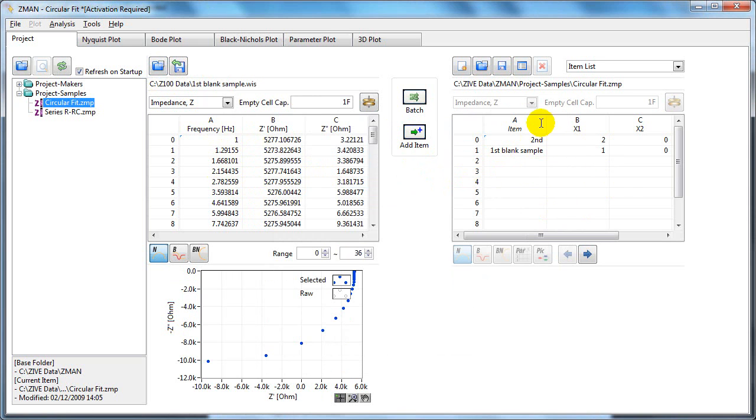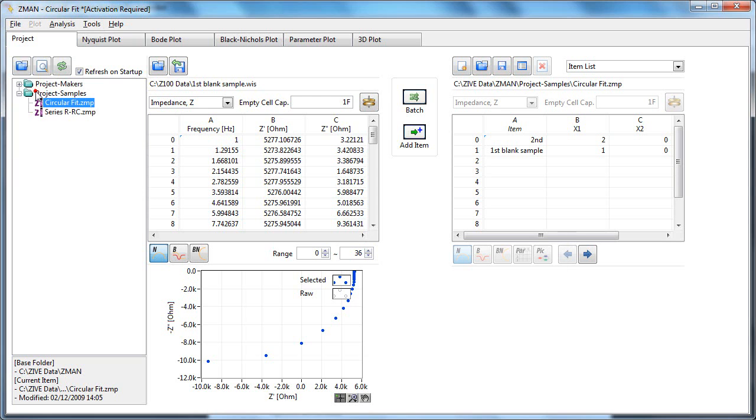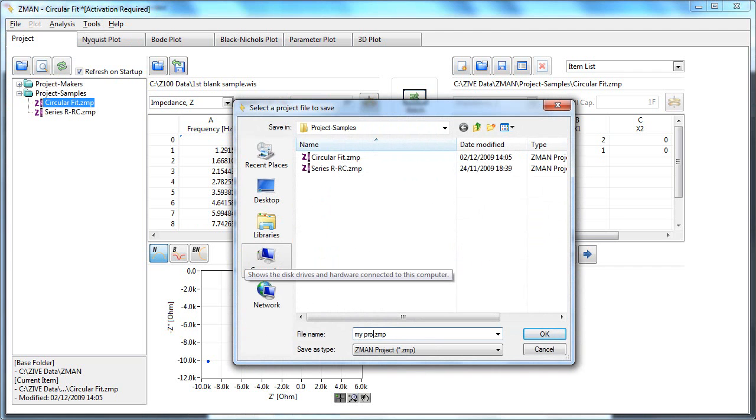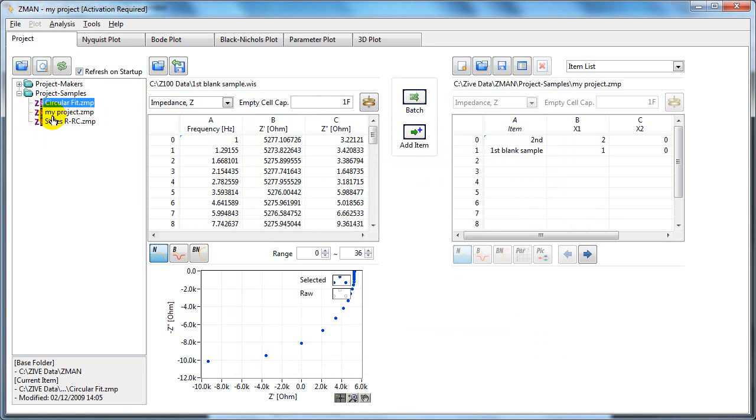Once you've loaded your files here, you can create a new project, save as, and give it a name. If you click refresh, my project is here, and next time you can just double click on here.